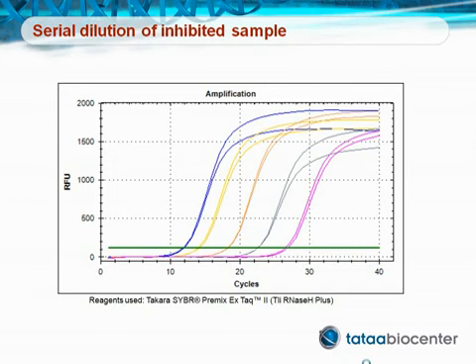If it is not linear, that is, if the first curve comes closer to the next dilution than expected, it might have been inhibited. This behavior is possible if the inhibition is of a kind that can be diluted away. When you know this, you can dilute your samples to a sufficient level so that the inhibition is not affecting, and then analyze your samples. To check your sample this way is not possible if you have too low concentration and small samples.